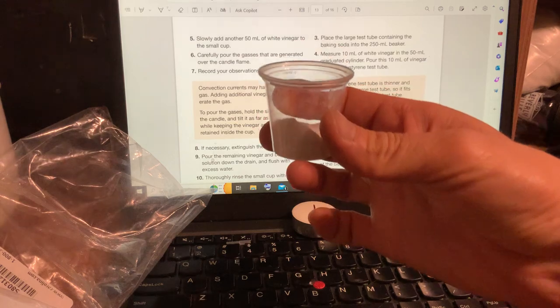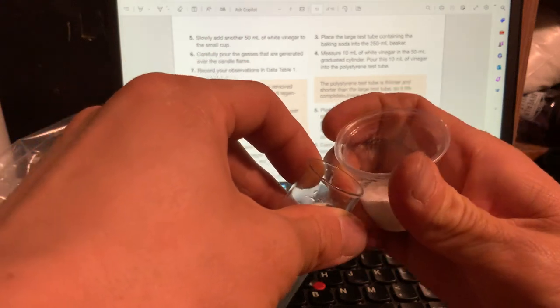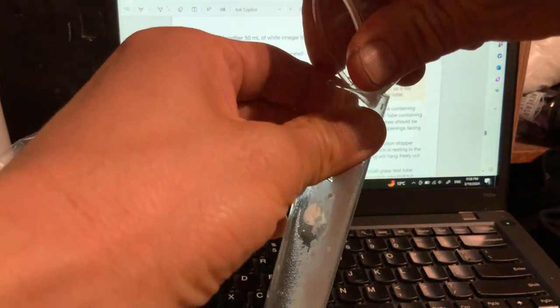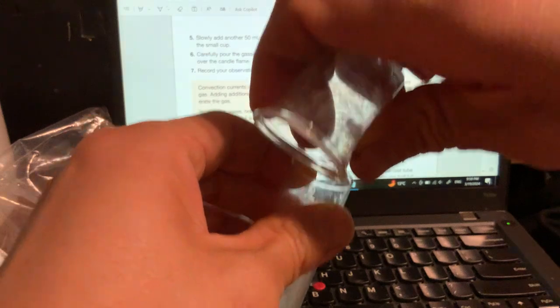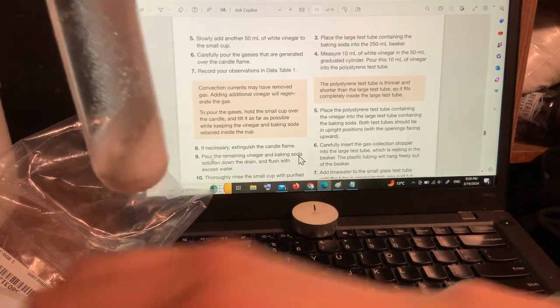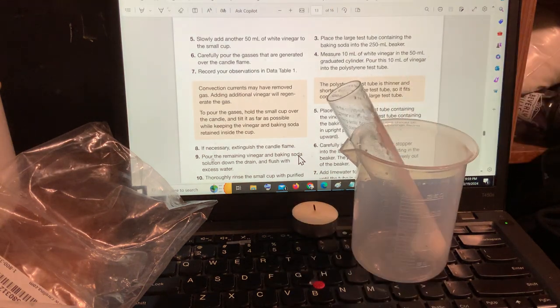It's about 5 grams. Okay. You could weigh your 5 grams if you want, but it's not quantitative, it's qualitative, so you don't have to weigh it if you don't want to. I'm going to squeeze this so I can pour the baking soda down in here. Tap, tap, tap. Got the baking soda. That's about 5 grams. It's not exact. Okay. Now I'm going to put this in my beaker just to hold it. I love that beaker for holding stuff.